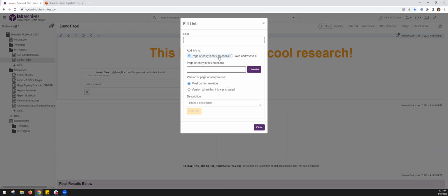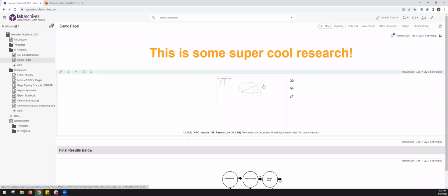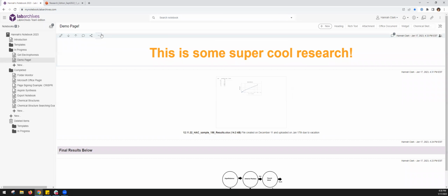And I think that's really valuable because sometimes in scientific research, maybe you do big data. Maybe you are a sequencing or imaging person and you have excellent Weill Cornell provided resources for those attachments. Keep them where it works, but provide those links, provide those references so the future viewer of your work can say, oh, cool, here's Hannah's notes. Here's her kind of summary of what was done. And here's the link to the raw files that might be stored elsewhere, could be in your EDC system, could be in a number of different places.